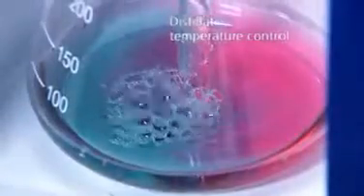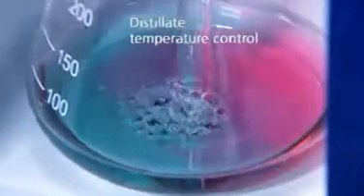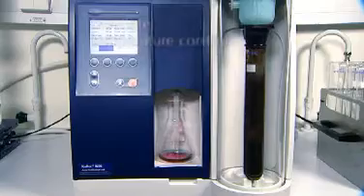The distillate temperature is measured before entering the receiver to make sure you get correct and reliable results.